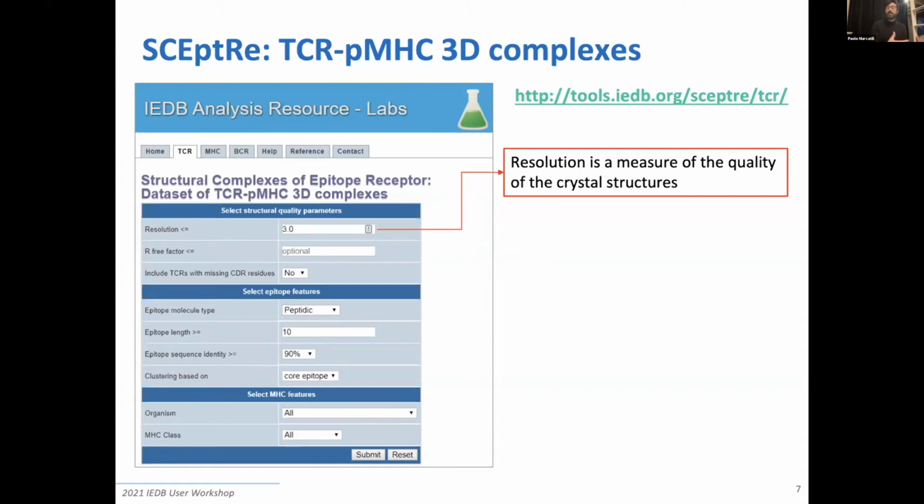And this is again connected to the experiment. In some cases, there are residues that are invisible in crystallography just because, for example, they are flexible and they move too much. So they are out of focus in the picture, let's say. In general, we don't want to include those, to be on the safe side, but there might be cases in which you actually want to have a larger dataset and also include those.